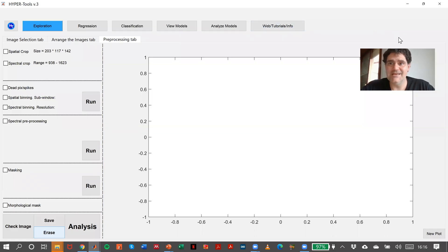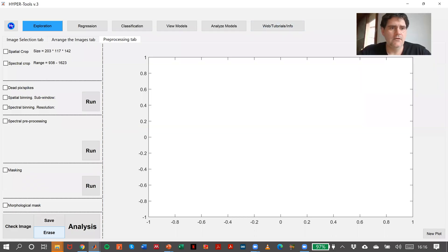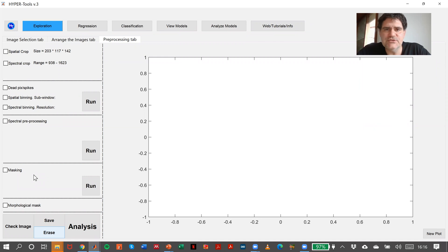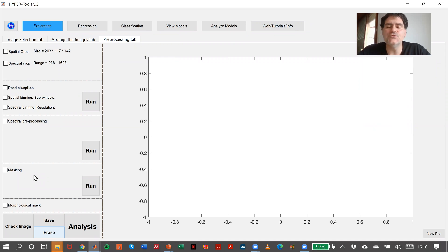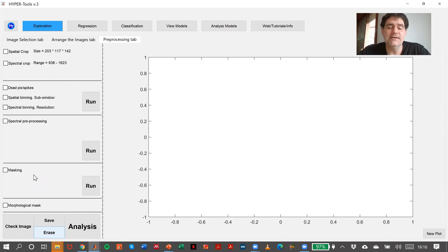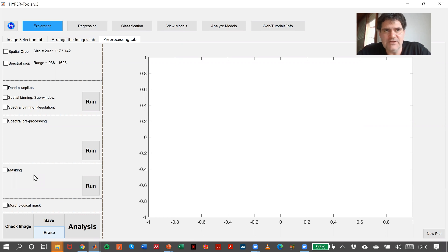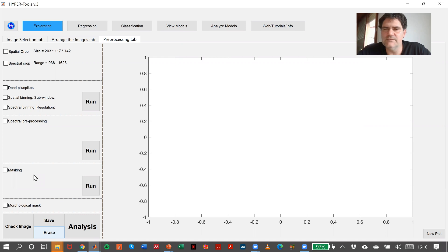Masking is a very important operation that will help us remove parts of the image that we don't want to analyze. In this case, we have a very annoying background, so we can try to remove that background from the image in order not to analyze it.